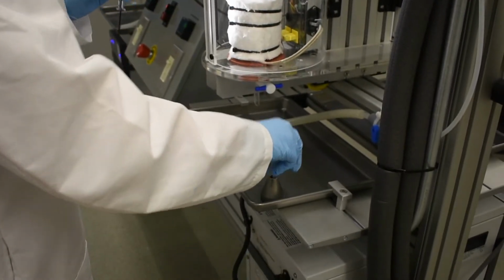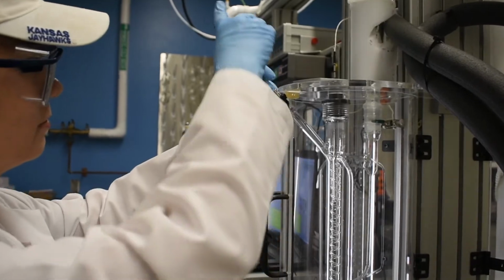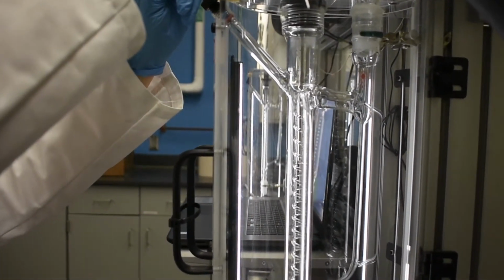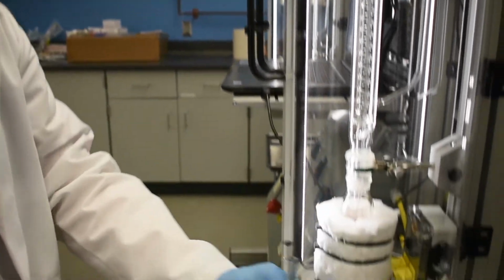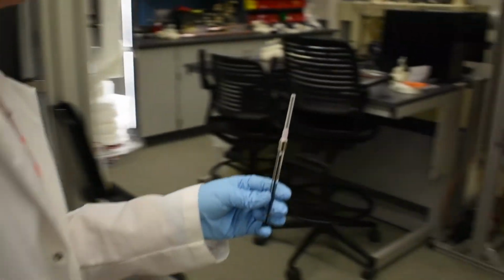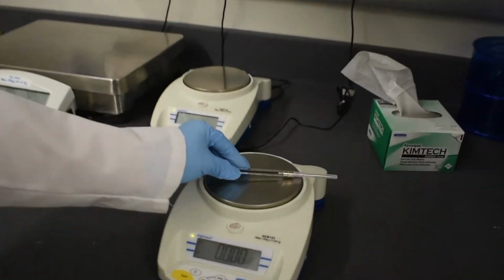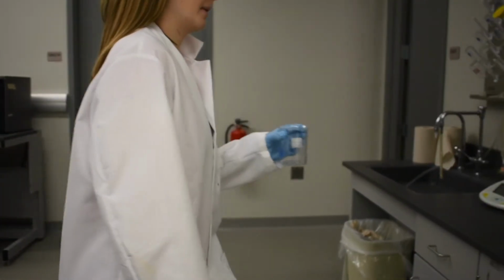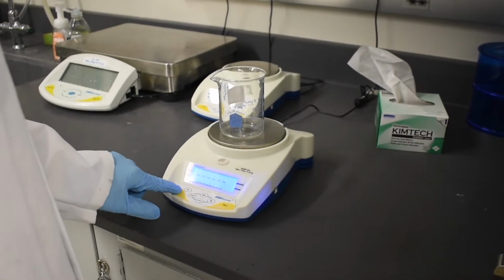Inject the solute into the injection port. This process will be repeated and a total of 5 solute injections should be made. Take the mass of the empty syringe in order to see the amount of solute that was put in the ebullirometer.